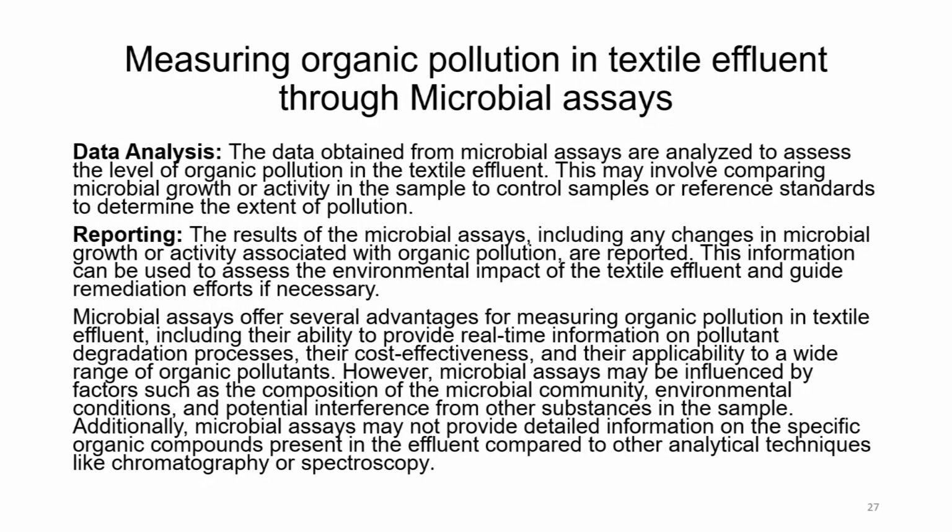Reporting. The results of the microbial assay, including any change in microbial growth or activity associated with organic pollution, are reported. This information can be used to assess the environmental impact of the textile effluent and guide remediation efforts if necessary.